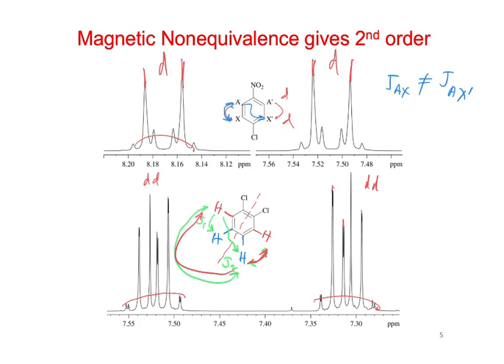So it doesn't really show any second order effects. Would a higher, well, I mean, if a higher frequency, you could just see the splitting on the actual peaks, right? Well, I think that's what we're seeing here. This here, so this is 6 hertz, right? And then the bigger one is 8 hertz. Oh, that's right, yeah. So all it's showing is just a doublet of doublets. It doesn't pay attention that these are, yeah. So I don't know how we simulate that kind of.